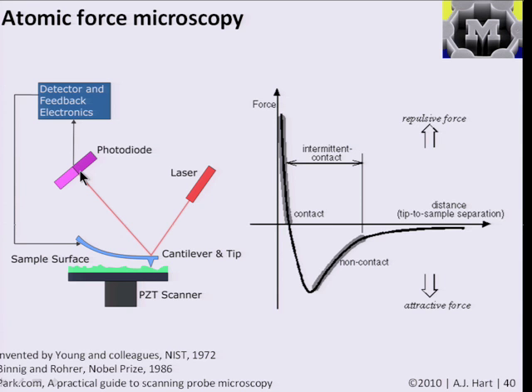And the fine attributes of AFM get into the actual molecular interactions between the tip and the substrate. And for example, if you bring your sharp tip close to a substrate, if in some cases you get, say, within a couple nanometers, because of the van der Waals forces or the intermolecular attraction between the tip and the substrate, as we'll learn about in a few lectures, the tip might actually get pulled down and contact the surface. Likewise, if you then try to push harder, you can't go any farther. You might get a repulsive force. So those interactions and how those interactions vary with different materials are important to really pushing the limits of this technique.